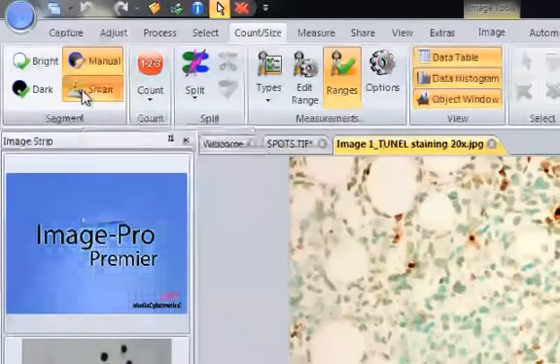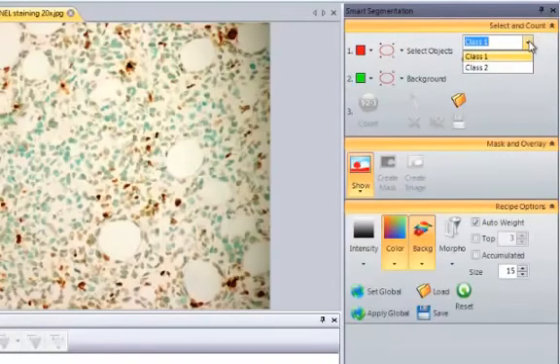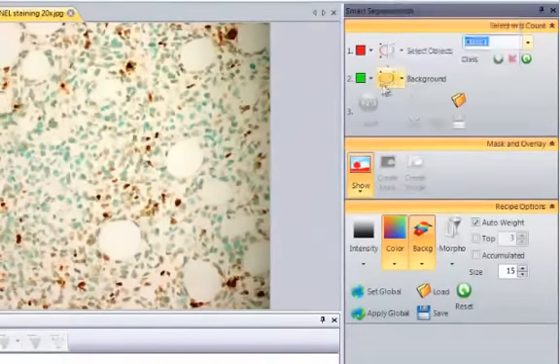Instead, we'll use a Smart Segmentation tool. Click on the Smart Segmentation tool, and there's enable on the right. Here, we can define multiple classes if required. Select what constitutes an object in the class, what constitutes background, when we're happy with count.